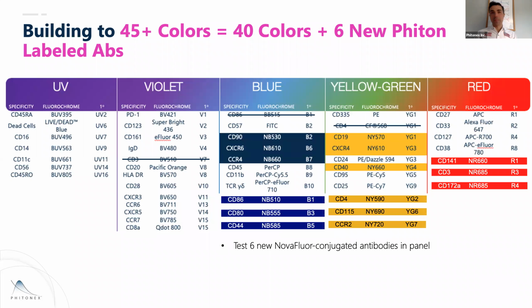And it ended up leading to some other things, which we'll mention in a moment, which is, well, crikey, how do you manufacture that many antibodies across having that many colors, right? I'll discuss how we did that in a minute too, because the how is just as fun as the fact that you can run N colors. That's not actually as important as what you learned as a result, and how you think about panel design where you can take spread away from the panel to get some better biology off the back end of it.